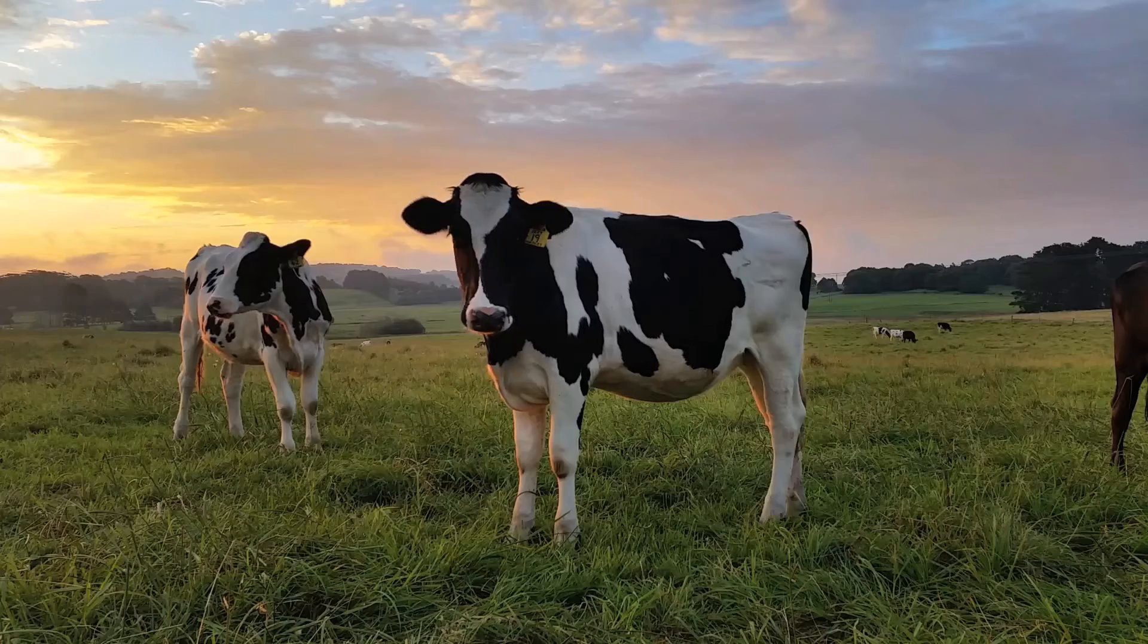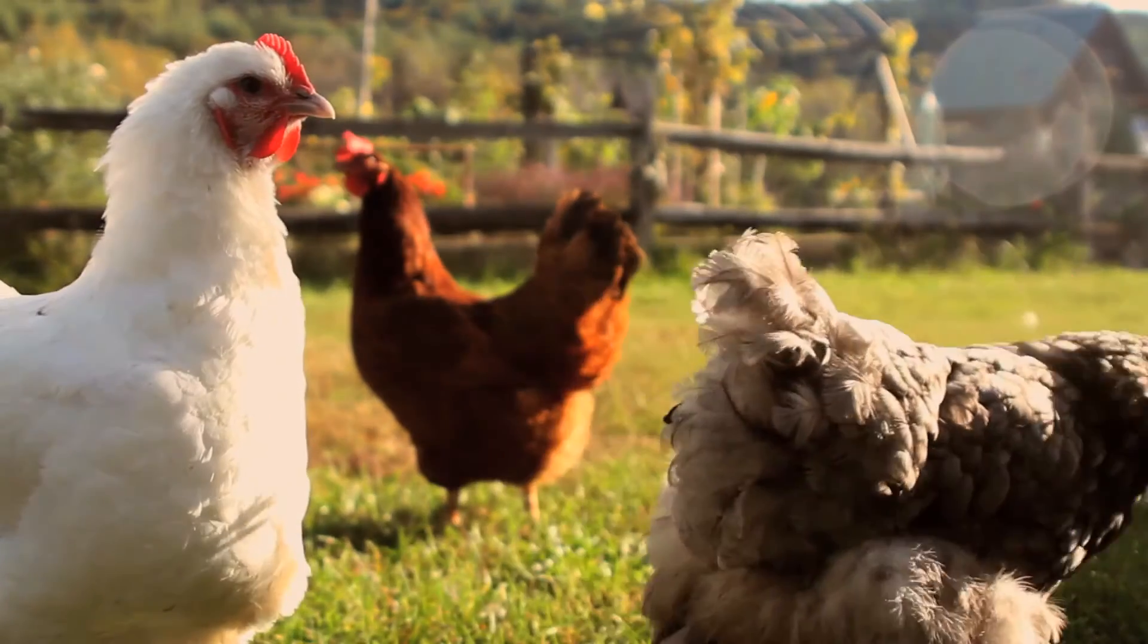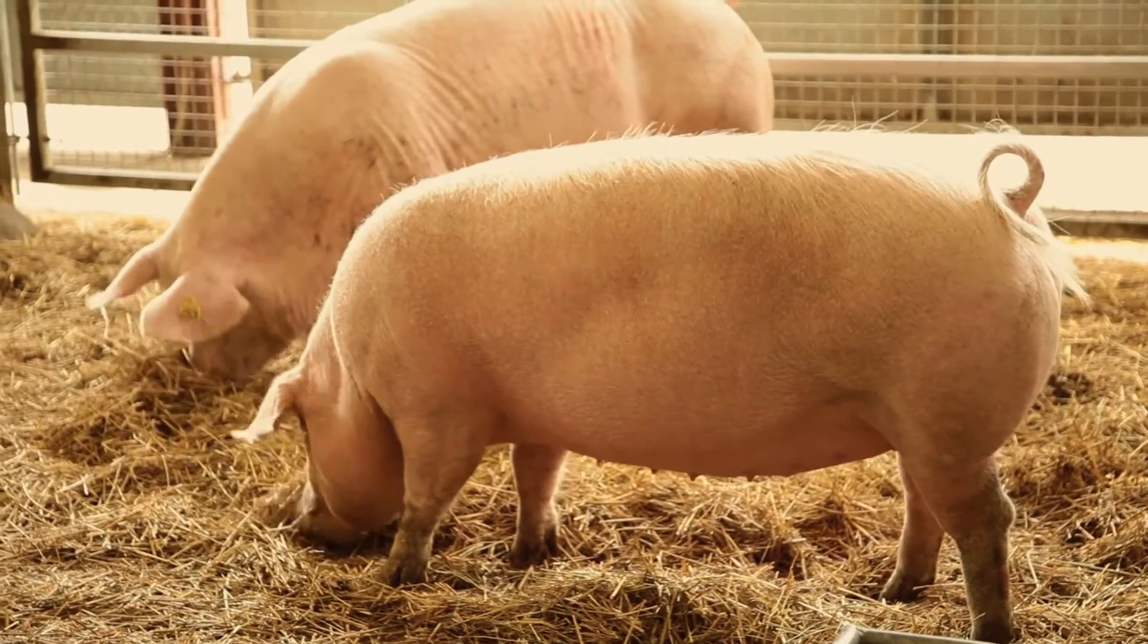Timely diagnosis of one sick animal can ensure the health of an entire herd, protect a producer's livelihood, and safeguard a lab's business.